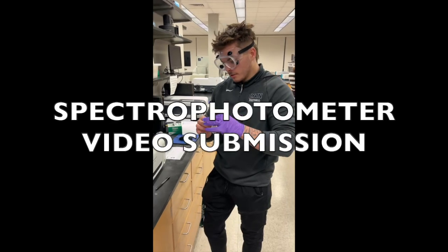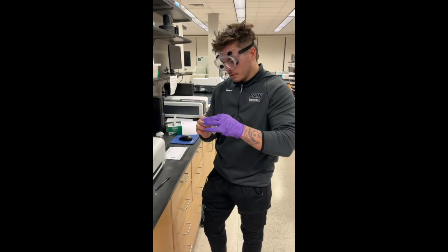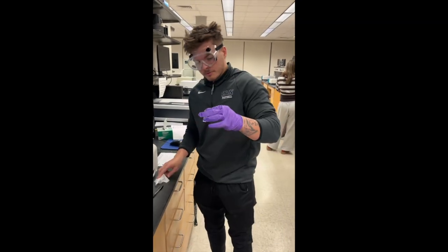In this experiment, we used the spectrophotometer to measure absorbance and determine concentration using the Beer-Lambert law. We first transfer a small amount of solution into the cuvette, making sure not to overfill it. Next, we zeroed the spectrophotometer using a blank to ensure accurate readings.